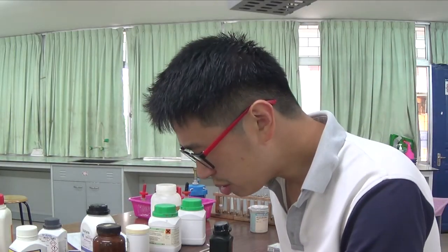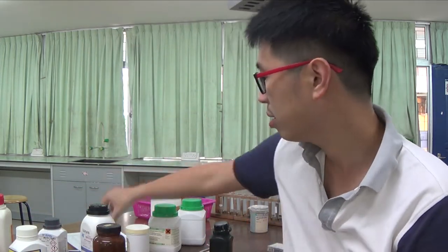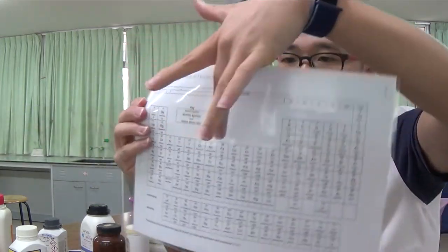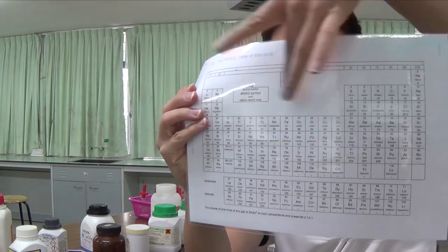Okay, so that's really what I want to show you on these: a few compounds, ranging from colored compounds of transition metals. Remember transition metals? Compounds of this series of metals, the transition compounds, are usually colored, and that's a property of transition metals as you have covered in the theory section of your chemistry.